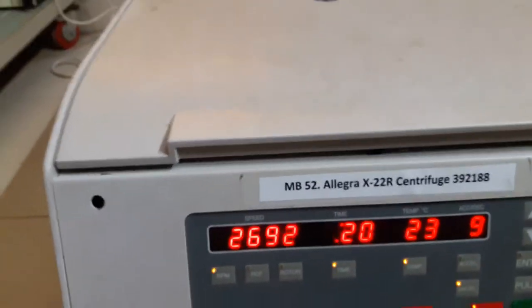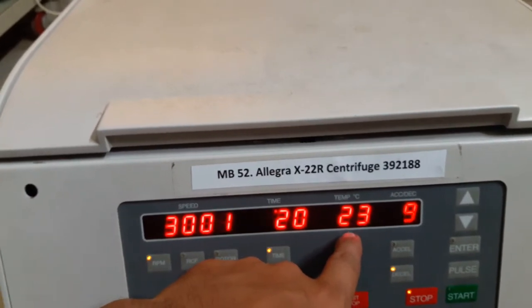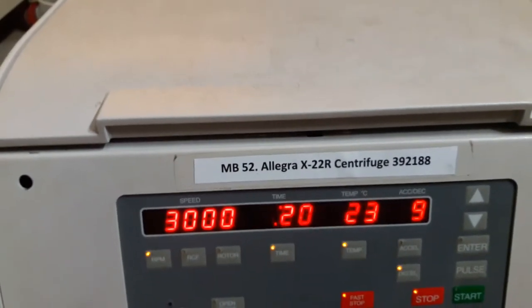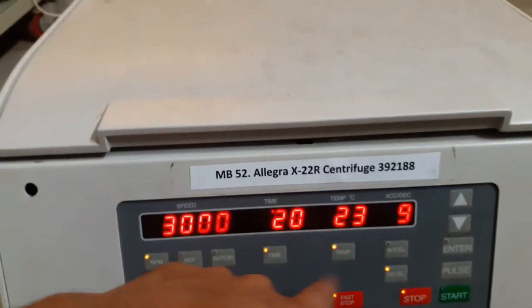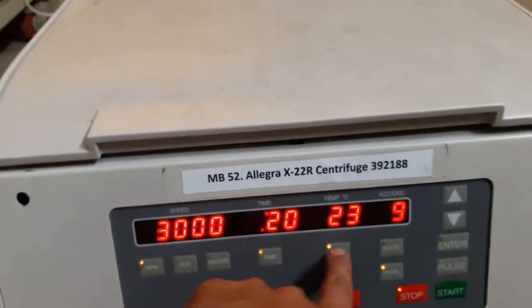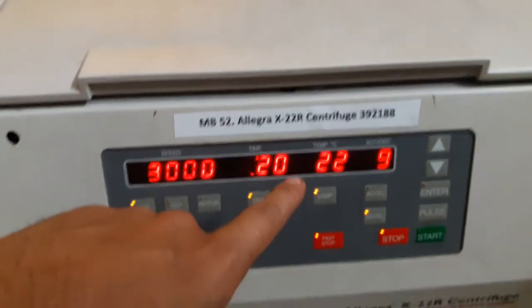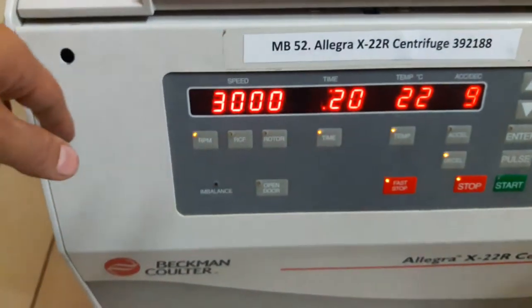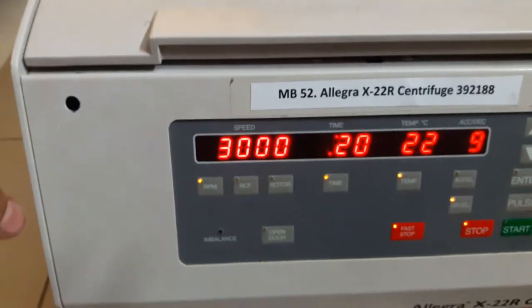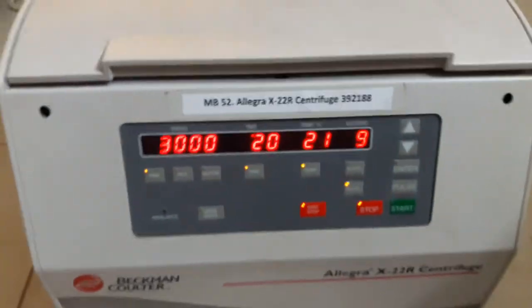It's working perfectly fine without any kind of vibration. The temperature is also going to drop very soon to 20°C, which was my desired temperature. You can also edit the speed and temperature during the run by pressing this button. You can see the temperature is dropping and the centrifuge is working at 3000 RPM. You can see the spinning rotor from here too — it's working very fine.